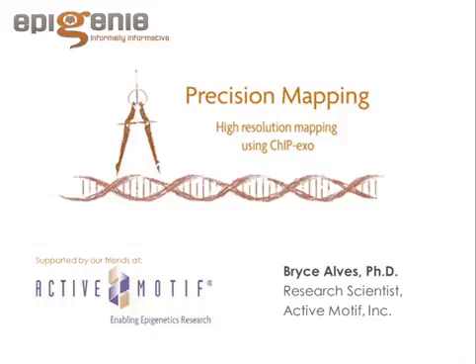What's the lowest amount of input cells that you have been successful using ChIP-Exo with? I have gotten very good coverage as low as 10 million cells, and I have actually gone as low as 4 million cells, but the library coverage and the peaks were very small when we only had 4 million cells to start with, so I would not recommend going below 10 million. 10 million would be my lowest, but for very good coverage, I would say stick with 20 million cells. Okay, so not quite a low input solution at this time.